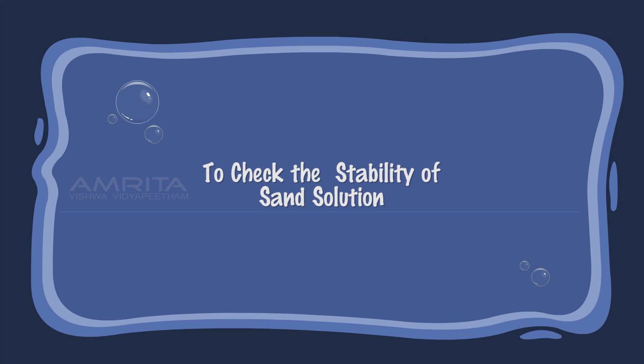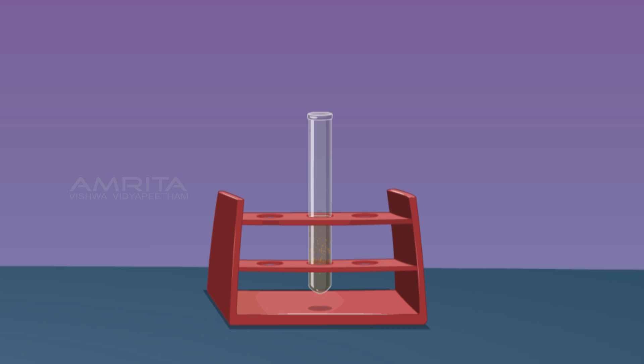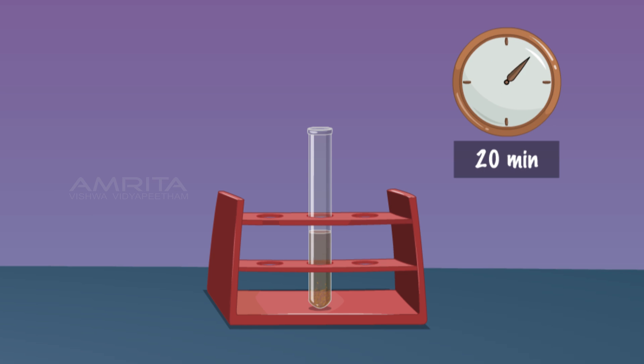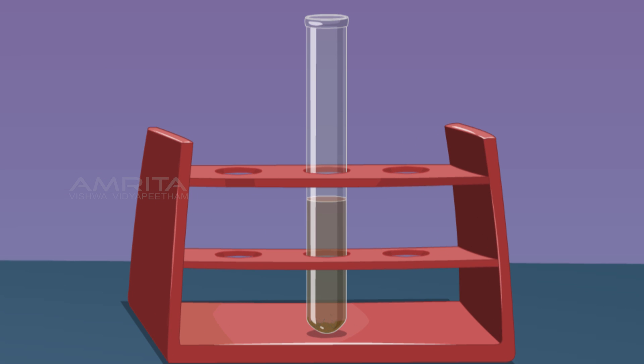To check the stability of the sand suspension, take some sand suspension in a test tube and leave it in the test tube rack for 20 minutes. You will note a gradual settlement of particles at the bottom of the test tube. This indicates that a suspension is unstable and shows settlement of heavier particles.